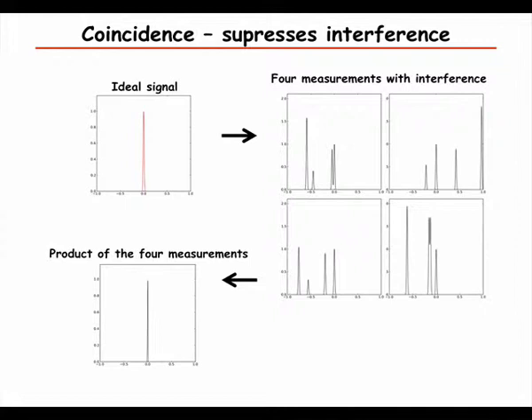Now we looked at it as a way to process data, but you can also do it when you do the experiment. That's also what happens when you fragment peptides and you require that you see several of the fragments, maybe you do another fragmentation of the fragments, and these would all be coincidence measurements that use this kind of principle.